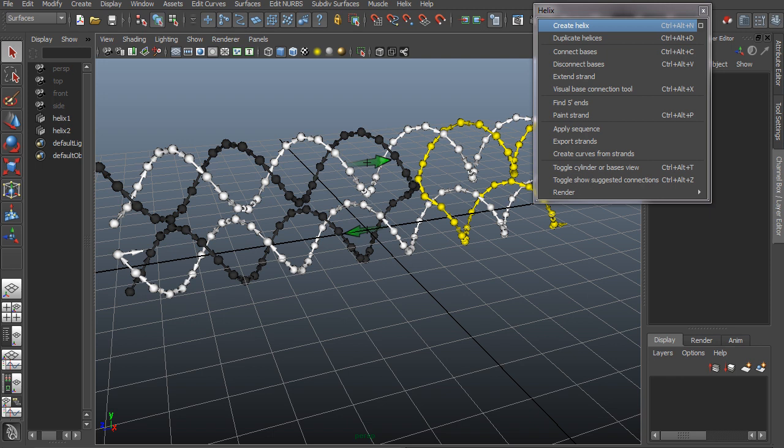Hello and welcome back to V-Helix for Maya. In this video I'm going to show you more of the features we have implemented, in particular how to render the DNA, different ways of visual aids, and how to put a DNA sequence on one strand and how that calculates the DNA sequence on the other strands and exports that to Excel.